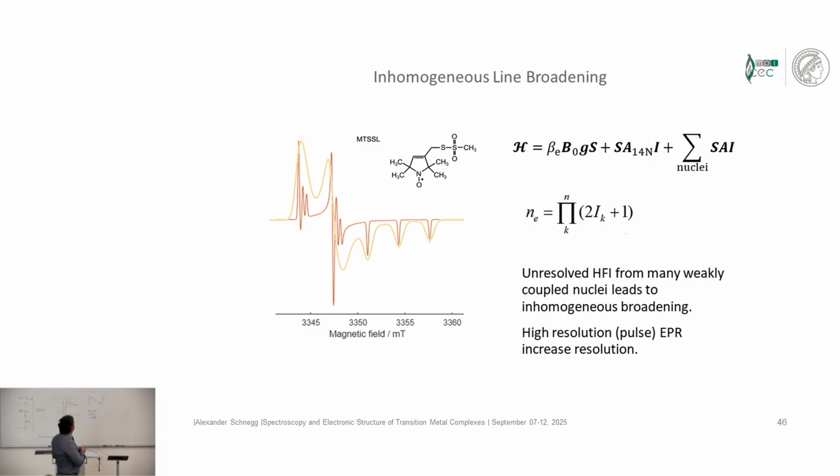And then here, for example, these 1, 2, 3, 1, 2, 3, 1, 2, 3 lines would be the hyperfine coupling of the nitrogen, and even though there is a lot of spin density sitting here on this NO fragment, oftentimes in the spectrum this is not resolved.